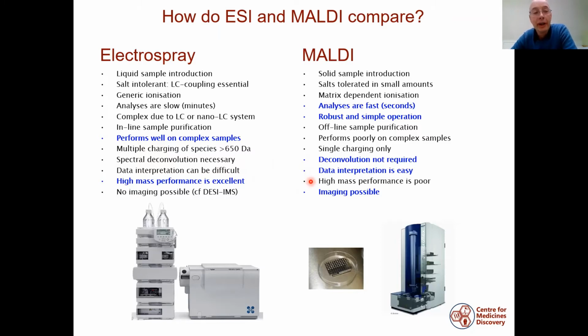What you will see is MALDI instruments generally are not used above about 20,000 Daltons. When they are, the mass accuracy is poor, and also the signal intensity is poor. And I certainly would not recommend MALDI for analysis of large biomolecules.